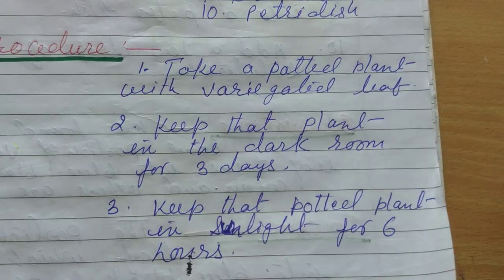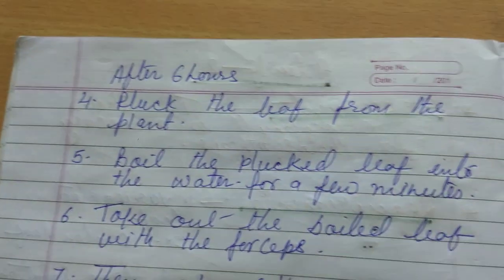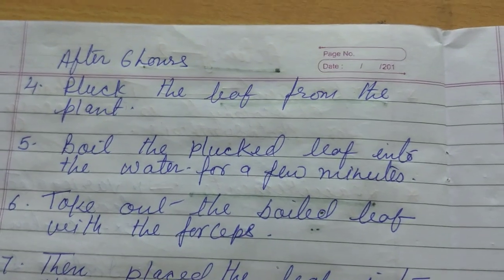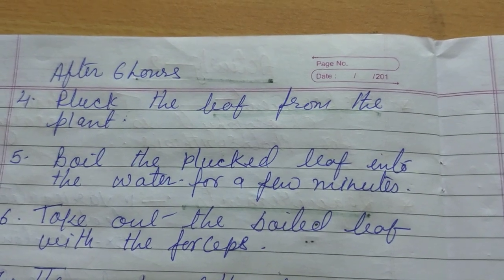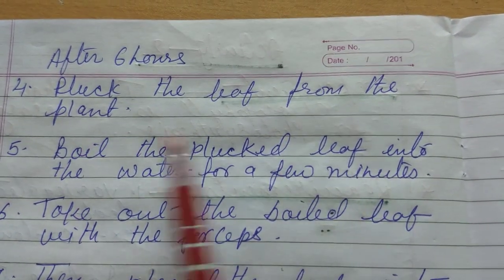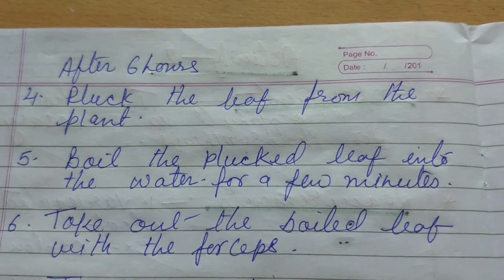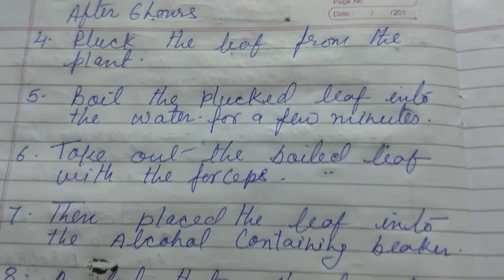For 6 hours. So what would be the next step? After keeping the plant in sunlight for 6 hours, we take out the plant from the sunlight. Then we pluck the leaf from the plant — that means we remove or take out one leaf from the potted plant.